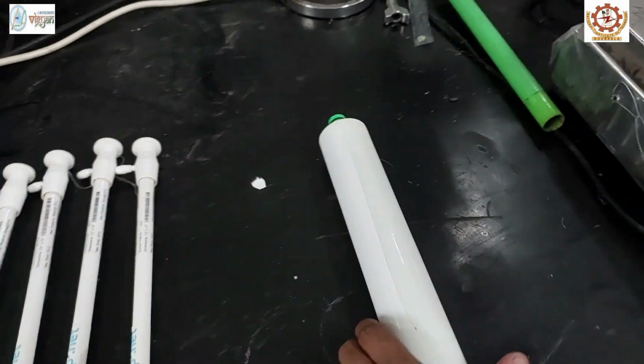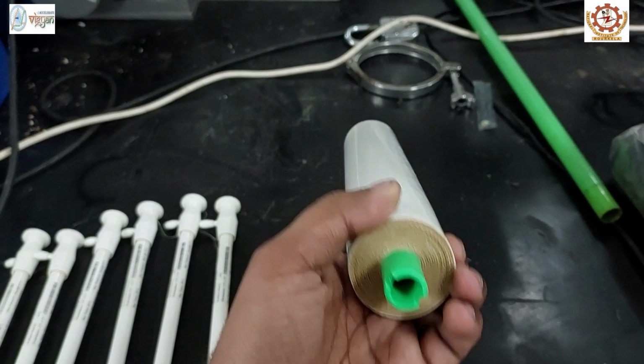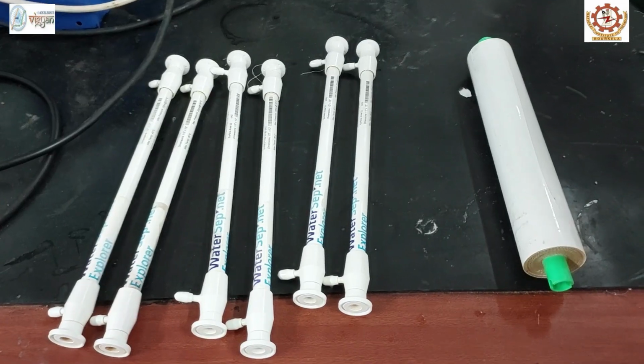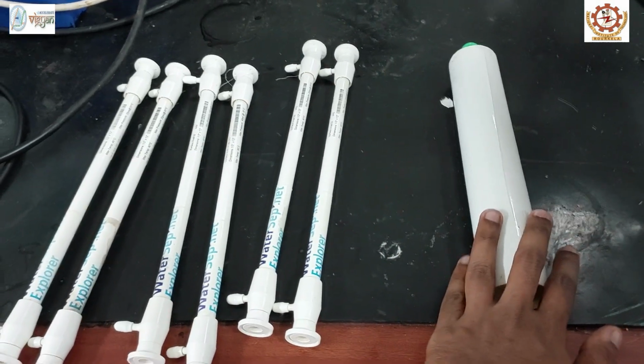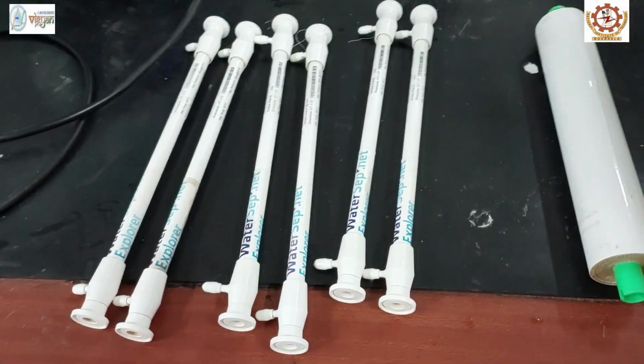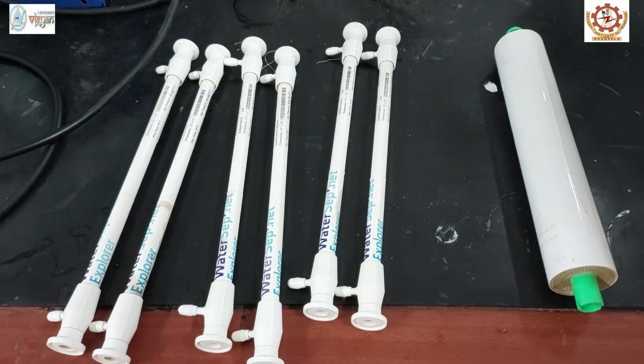However, this is a reverse osmosis membrane. The basic difference between these two membranes is not only in the membrane pore sizes but also in the membrane module.